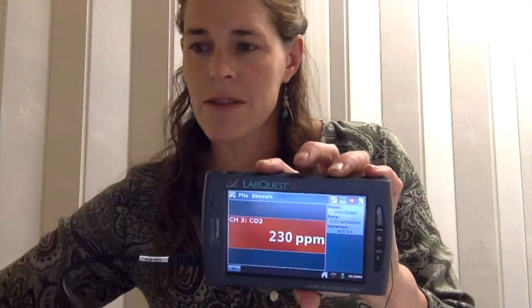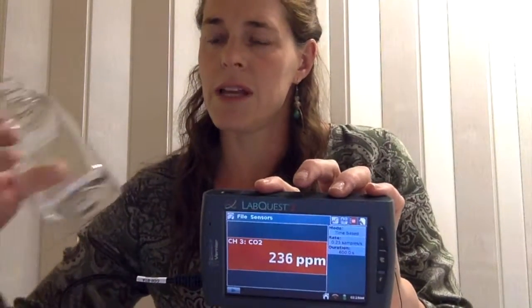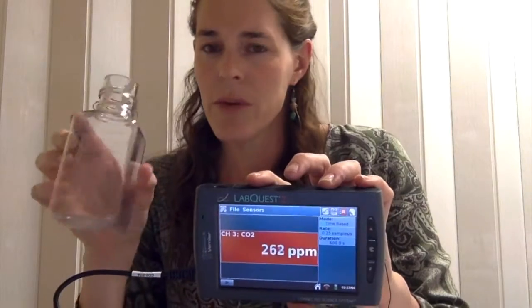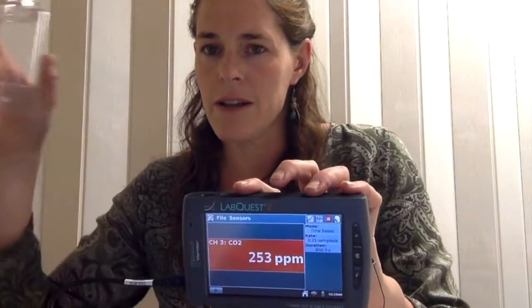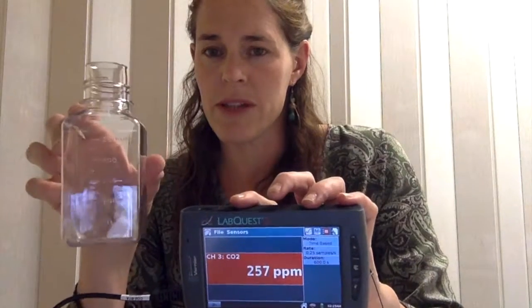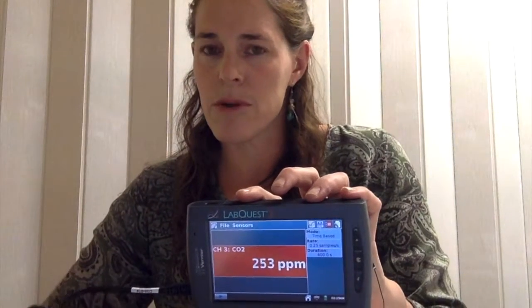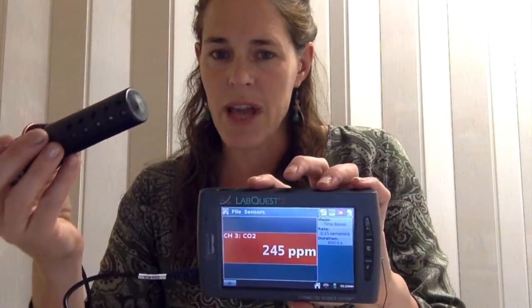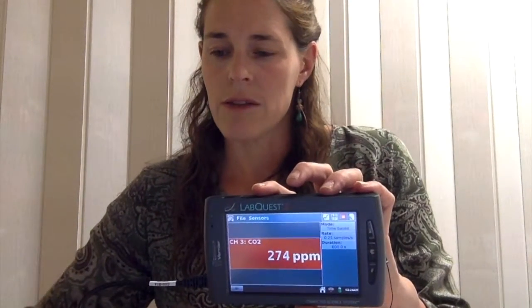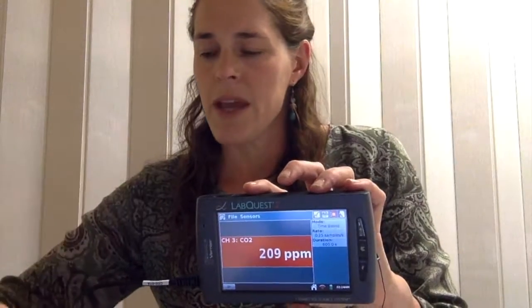You have this handy little respiration chamber in which you can carry out your experiment. The reason you want to do it here and not outside is that this prevents a lot of humidity from getting to the probe. If there's a lot of humidity, the probe isn't going to be as accurate. So if you can, do the experiment in a little chamber.